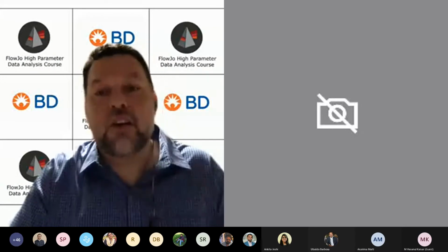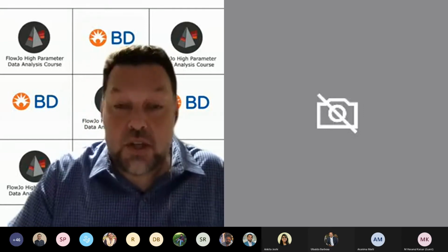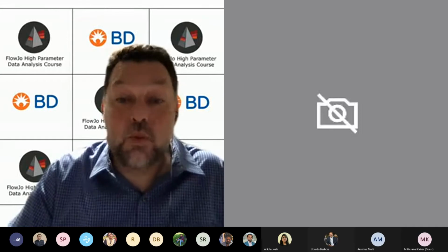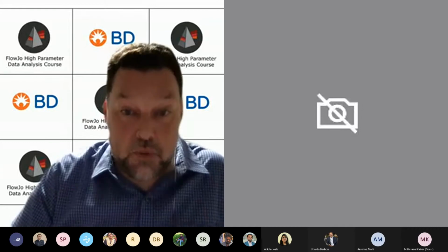Of course, it's important to get your compensation correctly applied, and I'll show you how to perform compensation and some new compensation alternatives or methods that we've enabled within FlowJo. And then we'll talk about plugins to use for high parameter analysis and how to set up those plugins.